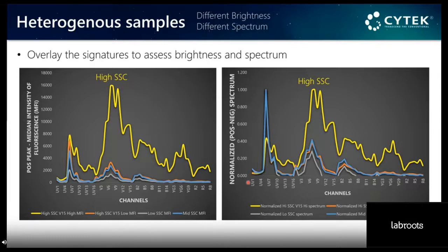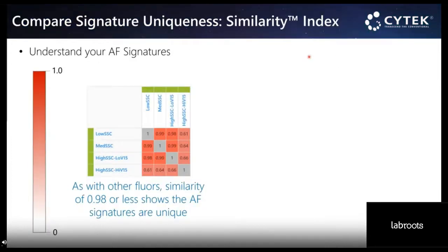When I now compare the normalized signature, 0 to 1, same scale, I can see how the 3 that are low on scatter are similar, overlapping in emission, and something that is completely different, that's giving me a different spectrum, and that now I can consider as a new autofluorescent tag, a new fluorochrome, since I have the unstained cells to define that new fluorochrome.